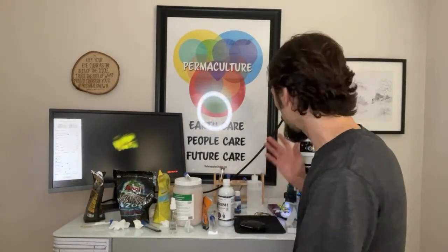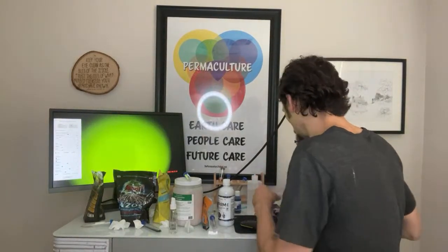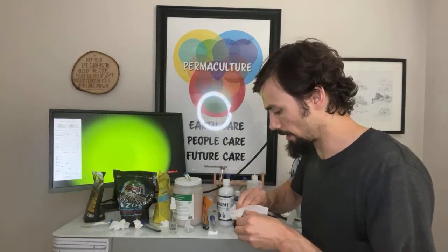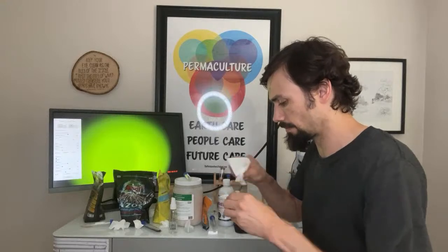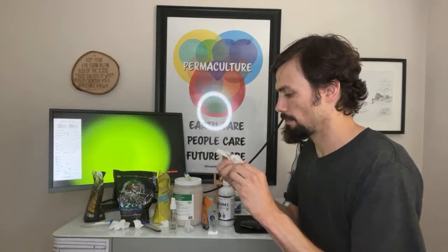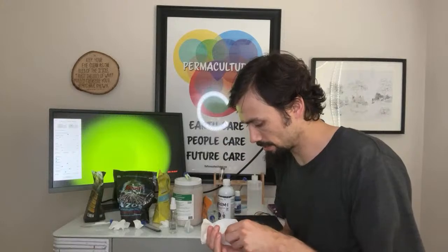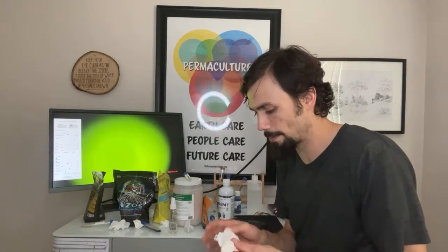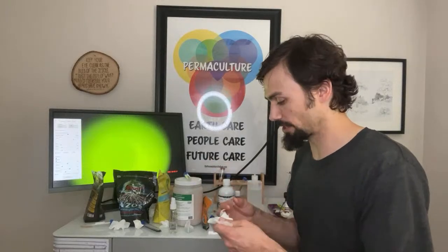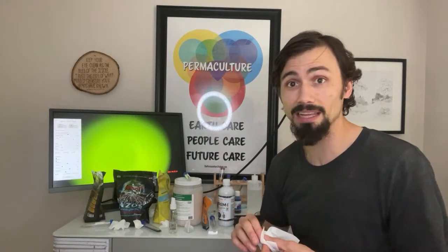All right, so let's keep going. I want to be able to get through everything. We've already been an hour. Okay, so already I think Mycos has some interesting things going on, but they're different. Everything is a little bit different, and you can tell that they chose their battles. This person was like, we're gonna go with spores. That person's like, we're gonna go with sections of root, because we didn't see any hyphae.